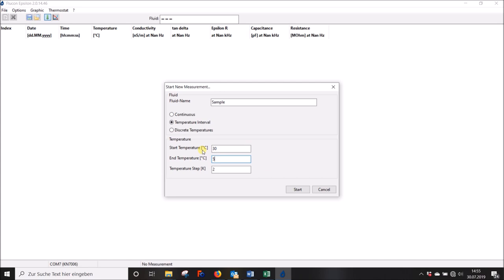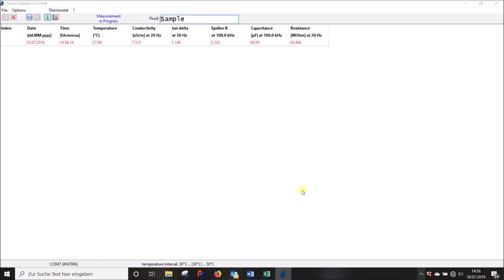Please note that only one value is determined at each of these temperatures. If you're looking for multiple values, use the discrete temperatures mode. Eventually click on Start to run your measurement.